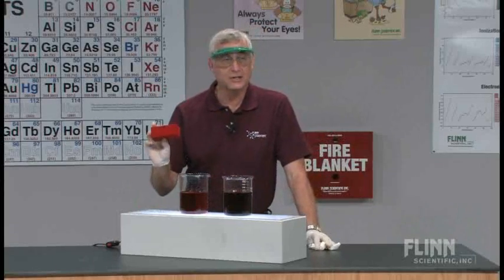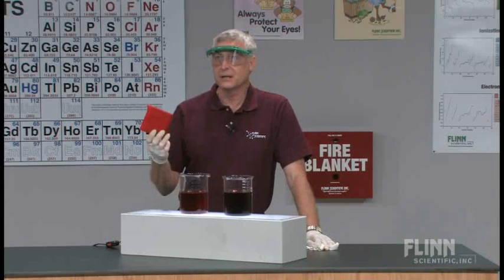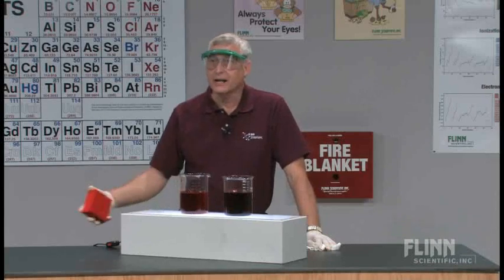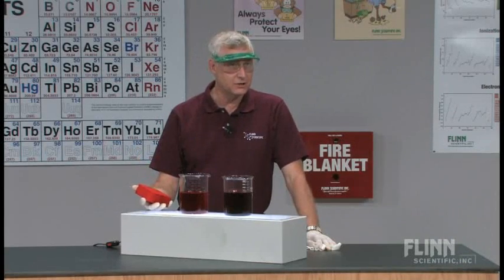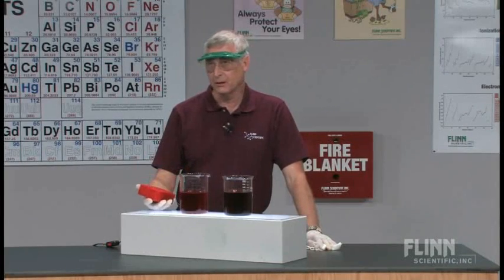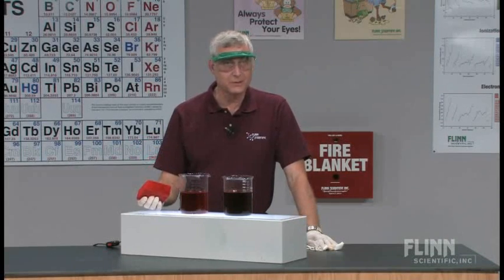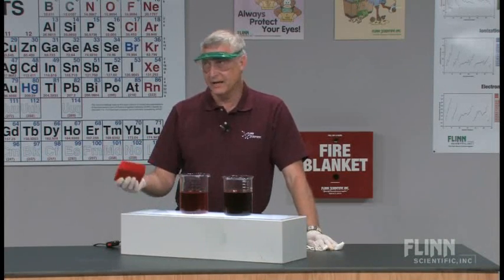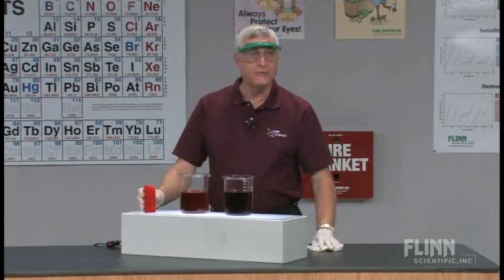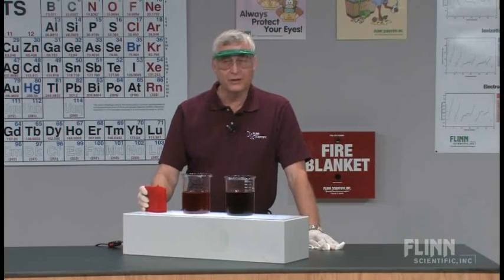Another way that you can use these sponges in a practical way is if you have some of these sponges in your lab area, some of them in the blue form, some of them in the red form. If you have a spill and you're not sure what that spill is, take a swipe at it with one of these Congo red stained sponges. And if it turns to the appropriate color, you know that you've got an acid spill or a base spill, and you can deal appropriately with it at that point. And the Congo red, once it's in the sponge, is good for the life of the sponge. It may fade slightly over time, but it will continue to work, and it's a practical way of helping you with your lab in terms of identifying unknown liquid spills, and then to be able to use it back and forth in the classroom as well.